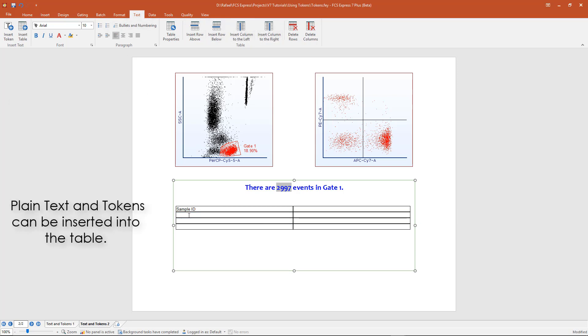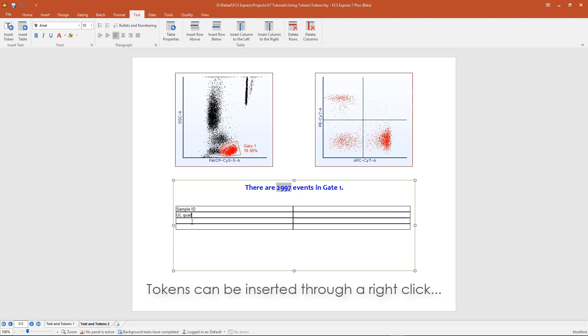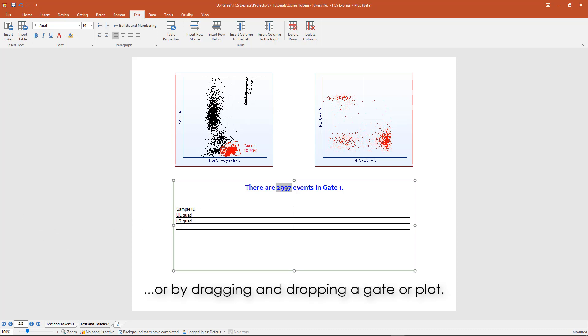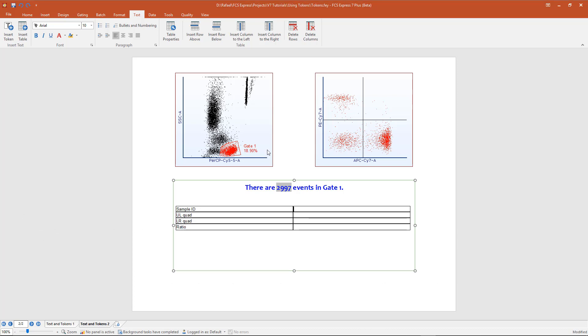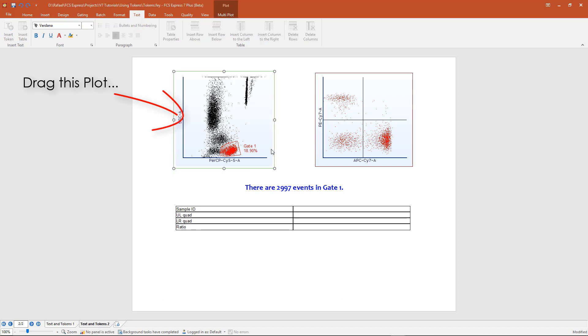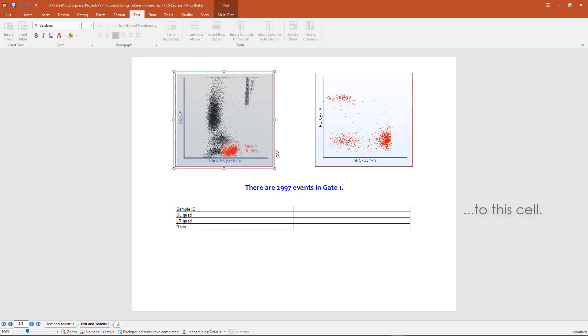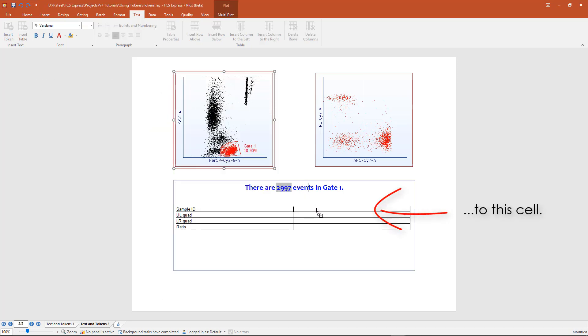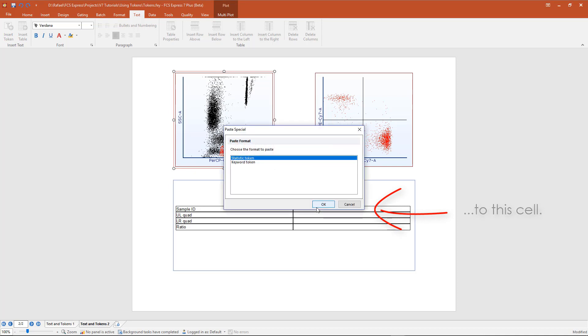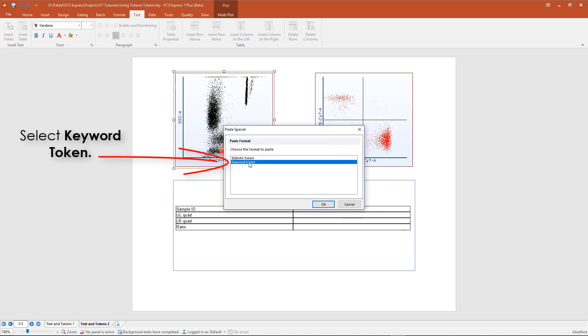Plain text and tokens can be inserted into the table. Tokens can be inserted through a right-click in the cell, or by dragging and dropping a gate or a plot into the cell. For example, by dragging the plot on the left into a cell on the table, I can insert a new token. Within the Paste Special box, select Keyword Token.